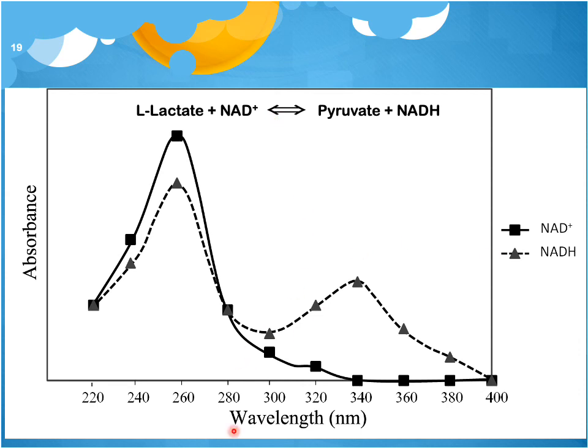From the figure, both NAD+ in the oxidized form and NADH in the reduced form can absorb light at a wavelength of 260 nanometers. However, only NADH can absorb light at a wavelength of 340 nanometers.